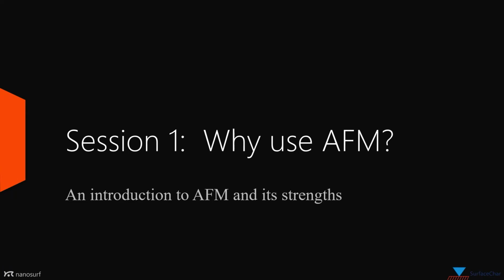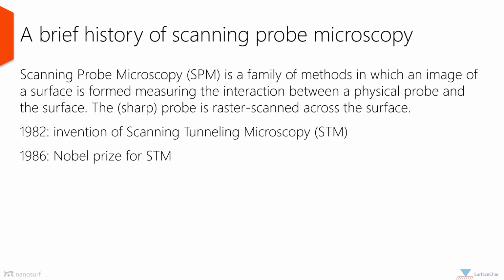So now let's start with session 1, why use AFM? And that's actually a very good question. I hope that within this session, I can show you why AFM is a very powerful tool and what we can use it for. But first, let's start with a brief history of scanning probe microscopy.